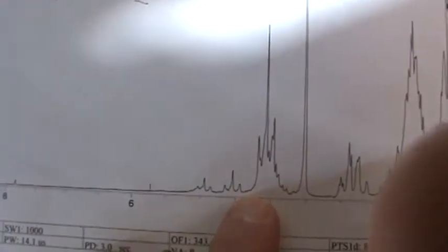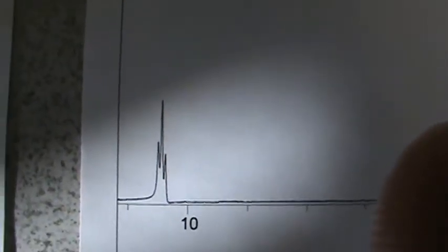This peak is right on 4. Can it be starting material in this student's case? And the answer is no, provided that peak of the aldehyde, let's double check that, the pure stuff had the aldehyde peak 9.7-ish. Interesting, not to confuse you folks, but if this happens to you, this student set their reference peak at 10.2. So obviously, this student should have set this one so that peak is a little further this way, which means that peak should be shifted a little further this way. So that peak right there is the alcohol starting material. But they did not quite do their peak picking correctly.